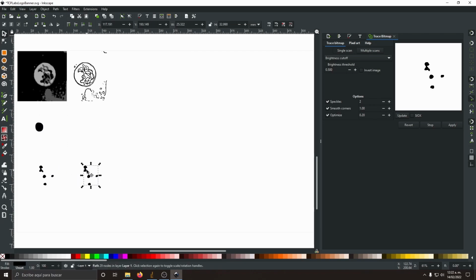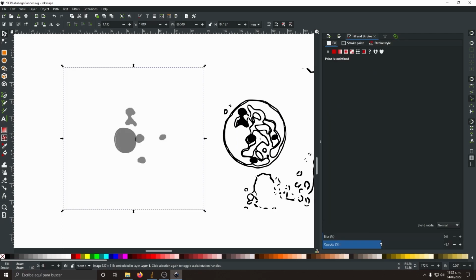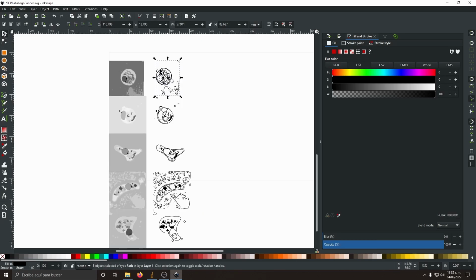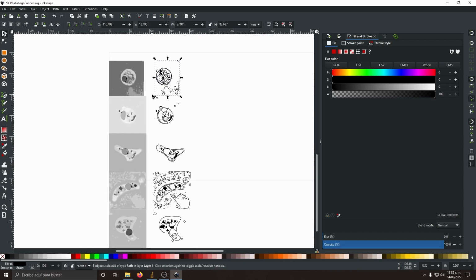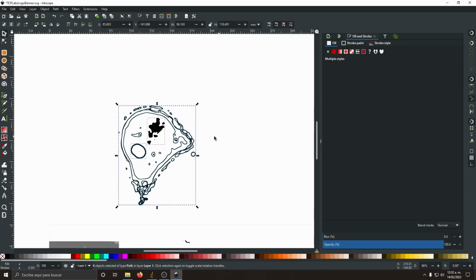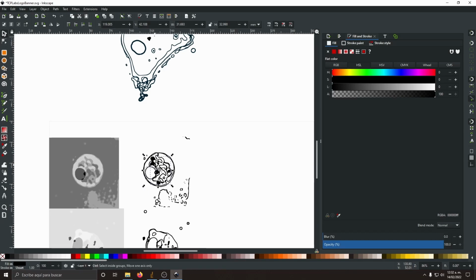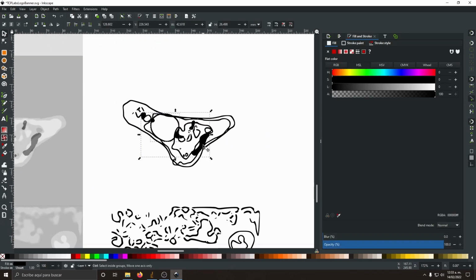Now we are going to move a little bit faster because all the proper image analysis has been left behind. Right now I'm just aligning everything and proceeding with the rest of the parasites. So here we have all our parasites, and what I'm noticing is that the images are still a little bit too complex. For example, this is the first parasite I processed, and it became much simpler and nicer, which is probably because it came from another batch of images taken in another experiment. But what I'm going to do is just remove some vectors of the image to make them look less cluttered and delete some of the surrounding stuff.